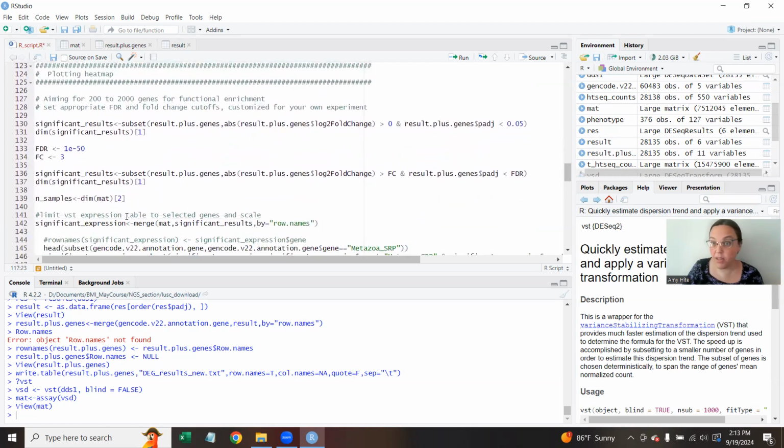Okay, so I'm not plotting them, but I want you as the user to plot them to make some observations about what you're seeing. The third plot we're going to consider is a heat map. And I've told you we need to get a subset of genes for our heat map. So we're going to filter based on the absolute value of our fold change and the adjusted p-value.